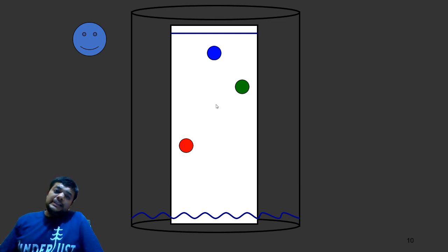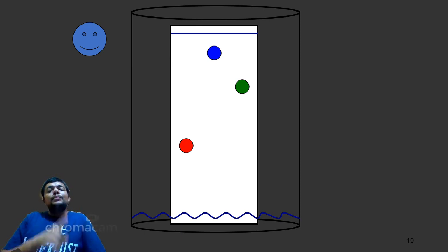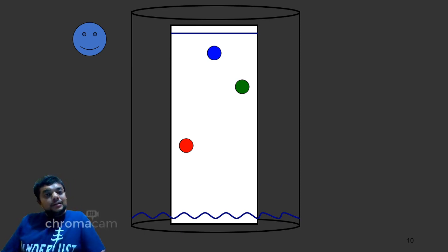Among these three spots, if we assume the surface for a while to be polar, then on the basis of like attracts like, the polar white surface has more attraction towards red, and hence among the three components red has to be most polar. Then and then only polar can attract a polar.